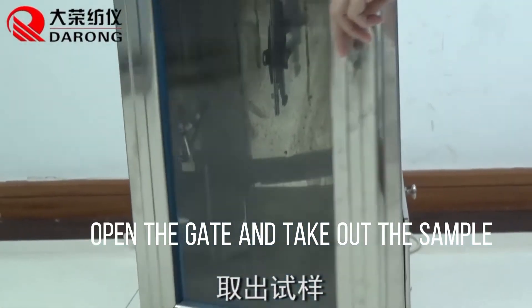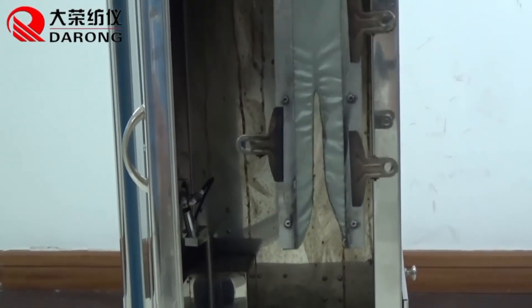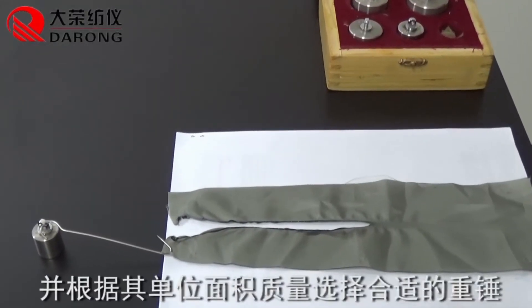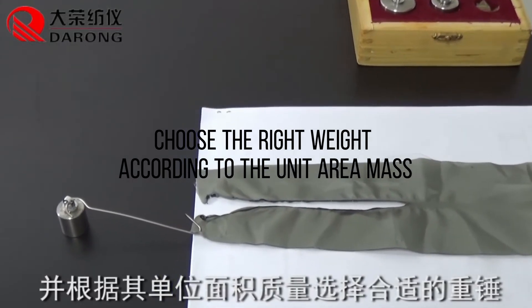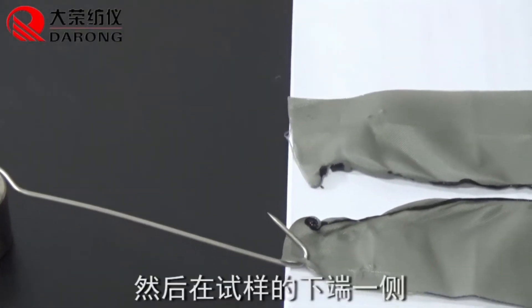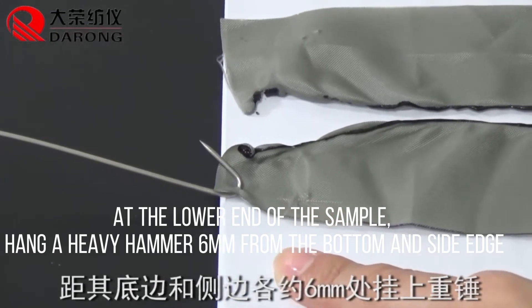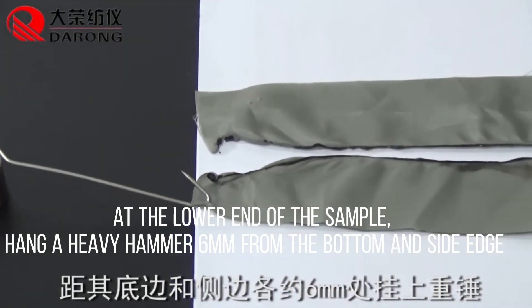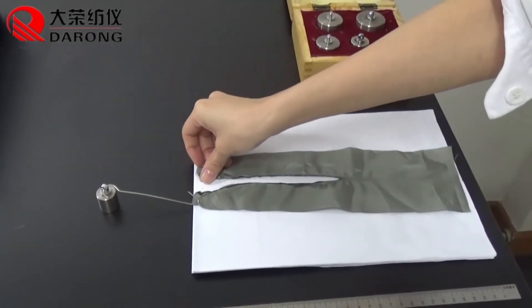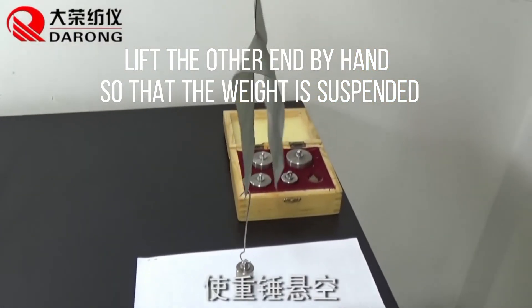Open the gate and take out the sample. Choose the right weight according to the unit area mass. At the lower end of the sample, hang a heavy hammer 6 millimeters from the bottom and side edge. Lift the other end by hand so that the weight is suspended.